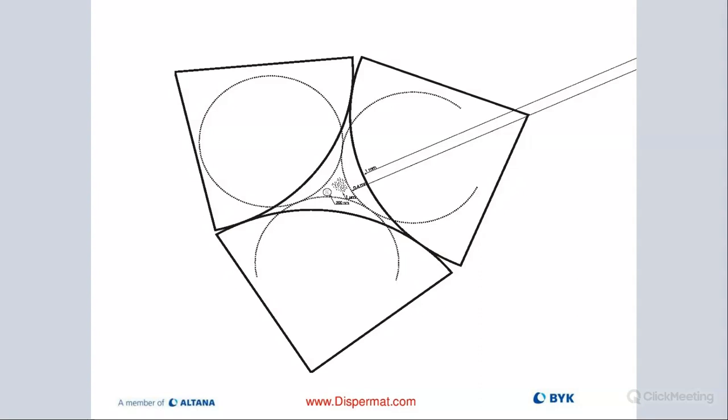You have two options. Either you stay with the 1 millimeter bead, and depending on the slurry, it may take you a long, long time to get there. Or I just reduce the media size to, let's say, 0.4 to 0.6 millimeters. That will allow me to mill better and faster and get down to my 600 nanometers. And then I do the same thing again if I want to go lower, until bead size makes no difference anymore in my particle size.